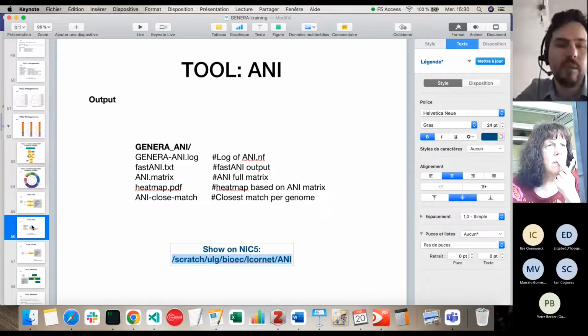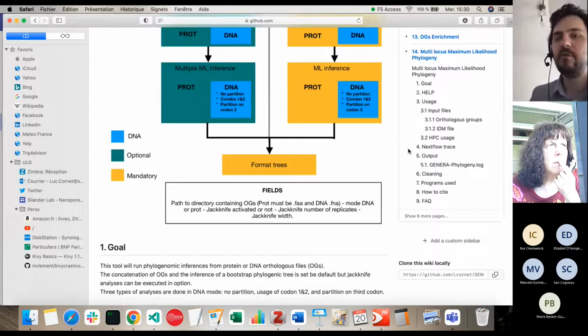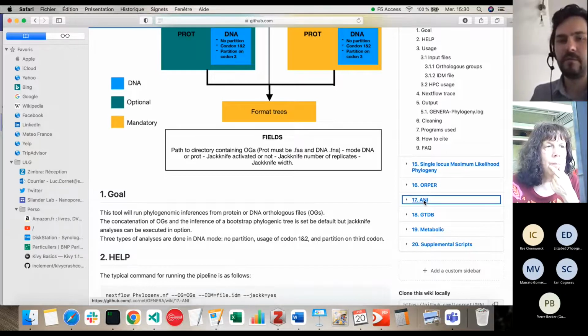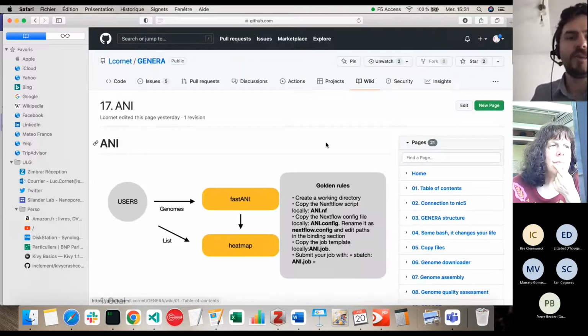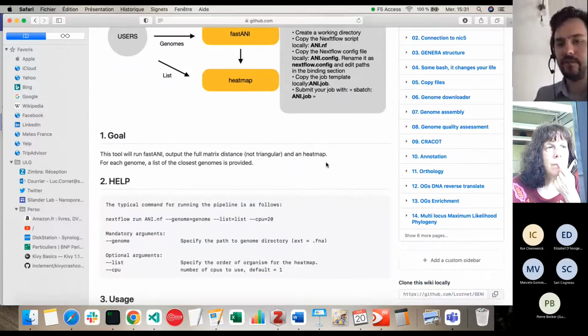That's for the ANI. So you can work also for eukaryote and prokaryote here. But I will show you that in the GitHub. Below 80% of similarity, the ANI values are not computed because it's not recommended by FastANI. They tell us that below, I think it's 78%, it's not computed. I don't have that here. I should add it. So I have a heat map, and the ANI values that are below 80% are shown in white in the heat map. But I will add that in the documentation because it lacks.